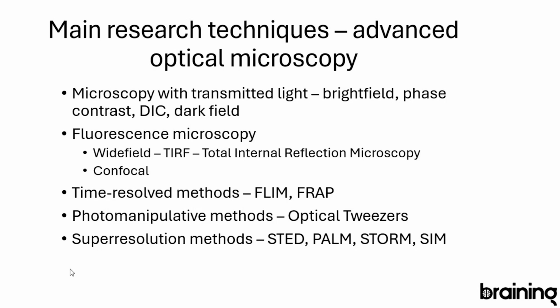And recent techniques, which are super resolution methods like STED, PALM, STORM, or SIM, can give us much better resolution than traditional imaging. So as we see, microscopy develops very dynamically. We are inventing new methods which can help us to work on our topics and get new exciting results.